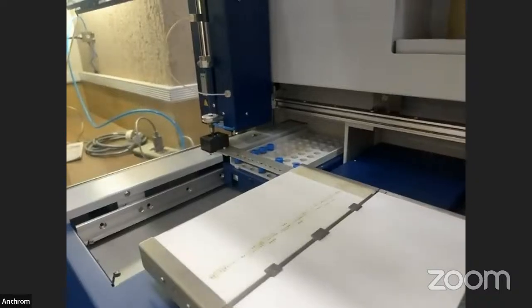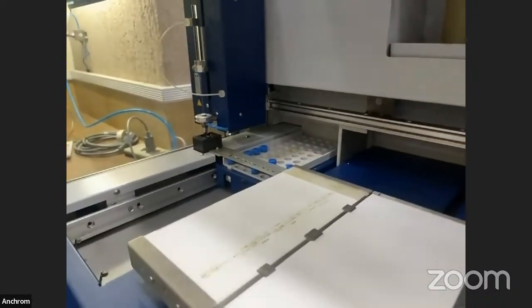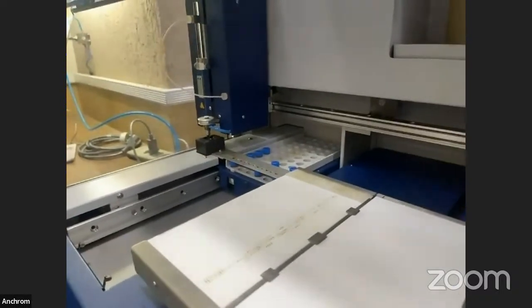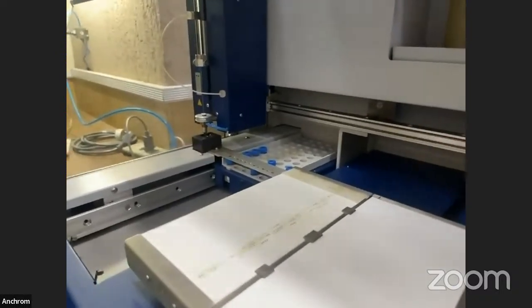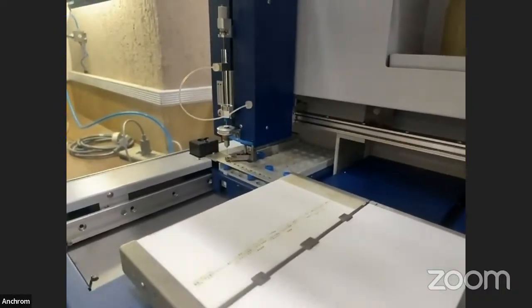So here the rinsing of the syringe is happening. So our first sample is being applied.